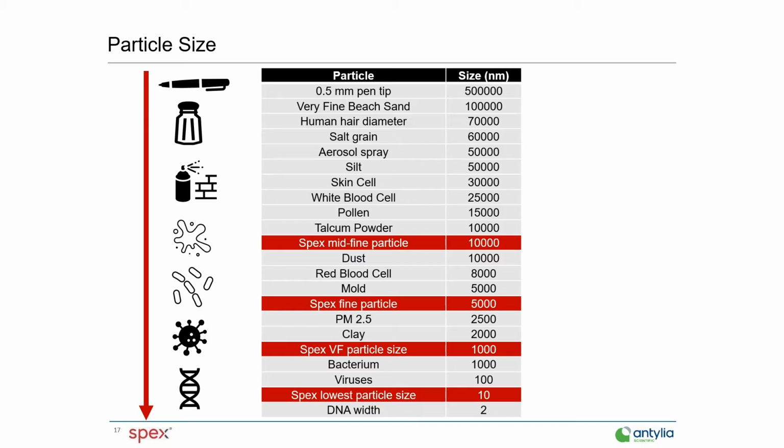You are going to have cell parts because you're doing cell lysis. If you are concerned about mold spores and you're grinding your particle size down to 1,000 nanometers, then of course you're lysing your mold spores and spilling cell contents out. You're not really going to have a lot of live mold spores. You're going to have mostly parts from the cell lysis. So this becomes very important if you're trying to keep cells alive.